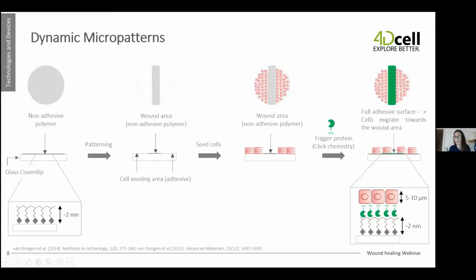So this is more or less the theory behind how the dynamic micropatterns can be used to prepare this wound assay. And Patricia will give you specific examples of experiments that we have done, and that will illustrate better and make it easier to see how this works.